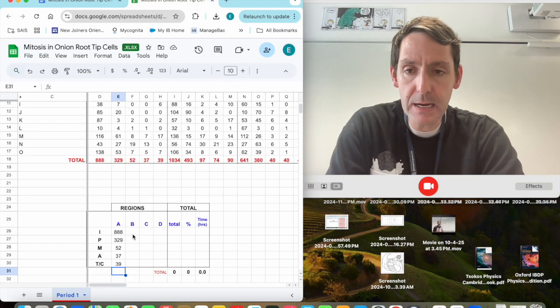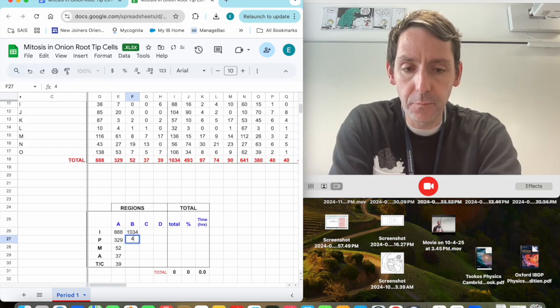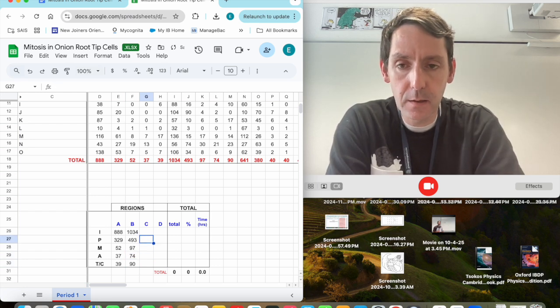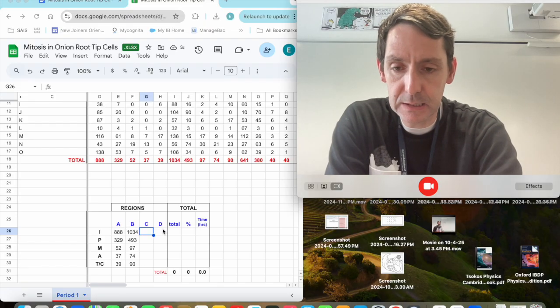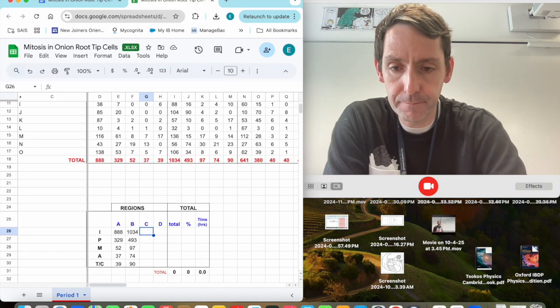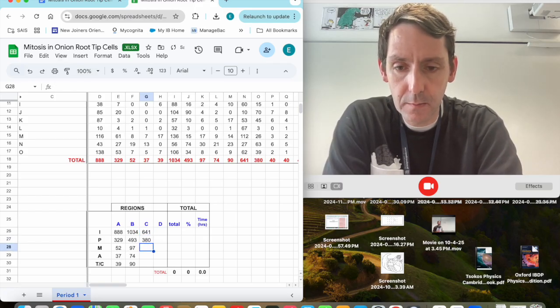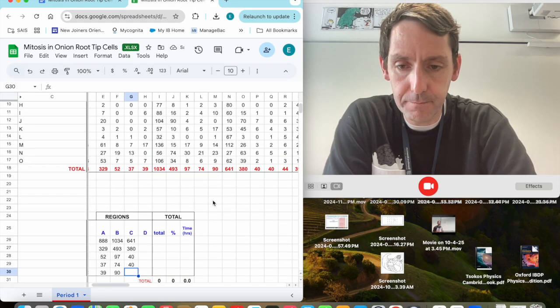So region B, I can see, is 1034, 493, 97, 74, and 90. Then we'll move on to region C. So 641, 380, 40, 40, and 44.